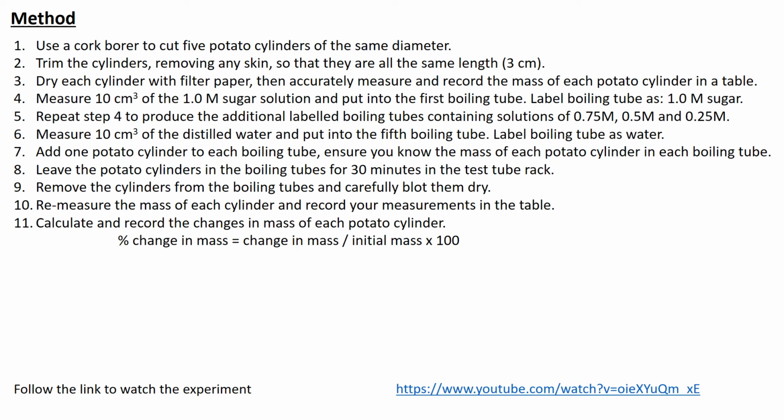Then we're going to look at the method. Again, there are 11 steps to this method, so use the video that we did earlier about reducing that down. Right? You're going to cut your cylinders. You're going to trim them to the same length. So try and put these in maybe 3 to 5 words as you go down.